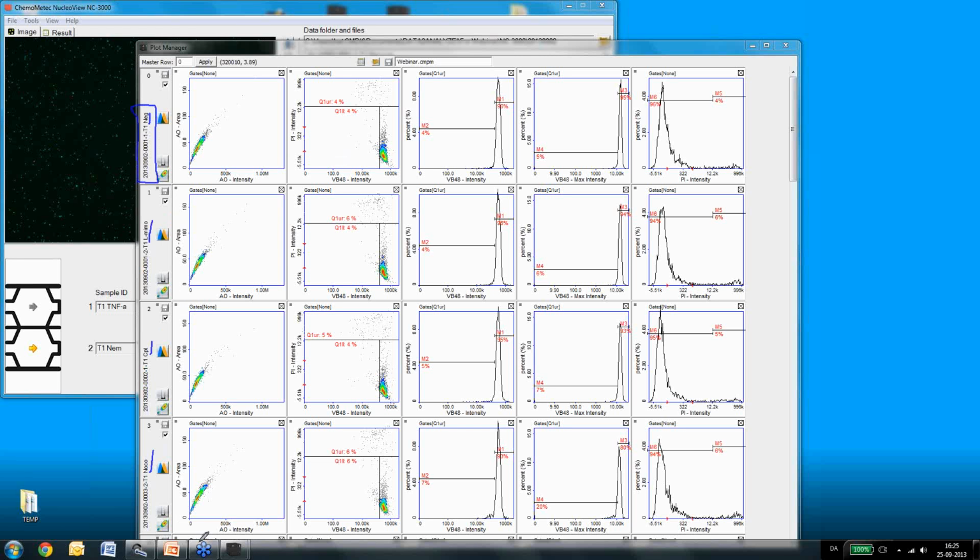It is easily seen here that after some hours of treatment, there is a shift in some of the samples. However, the shifts are not that profound. You see it going from 4 and staying on 4%, and for the NucleoCounter, it's slightly moving in. It's a non-significant shift, you could say.